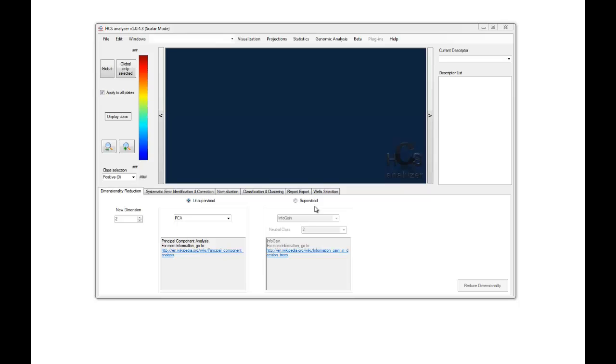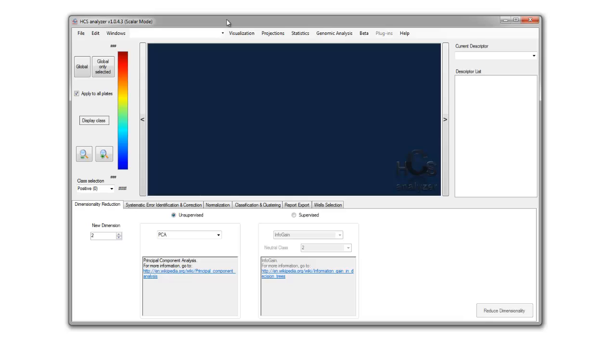So welcome to the HCS Analyzer tutorial. What I propose as an introduction to the HCS Analyzer software is to give you an overview of the user interface that has been developed.